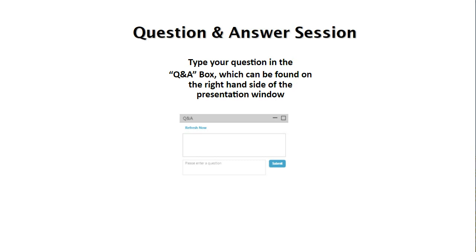So that's a nice segue to the next question. Are there common ways to identify, ahead of time, false negatives for an Ames assay test? Well, I've been involved in setting up the Ames assay. I'm not an expert in detecting false negatives. I remember that there is something like a background lawn, so like micro colonies in the background. But that's something that should be addressed by an expert in running and interpreting Ames results.